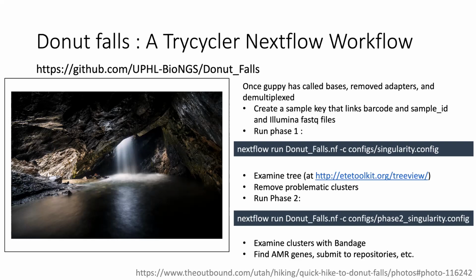It reads files in from that directory structure, runs them through Filtlong and the initial phases of Trycycler, to clustering, and pauses for a bit where you can examine the tree, manually remove problematic clusters, contigs and sequences, and then you restart the workflow for phase 2.